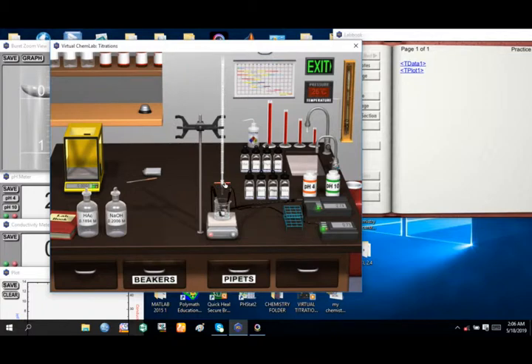We can now run it straight to the slanting position until it is about 23, where we can start dropping it drop by drop. Remember, in this case, we've not saved, but let us save our data as the experiment is running.